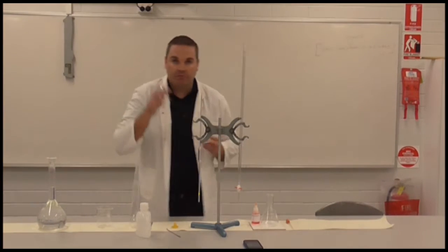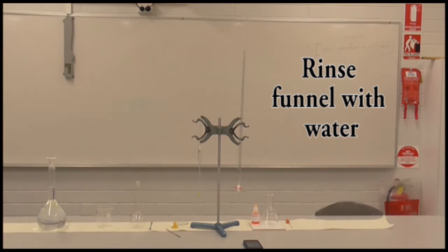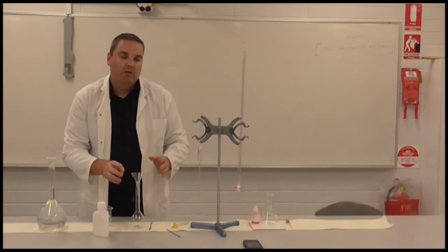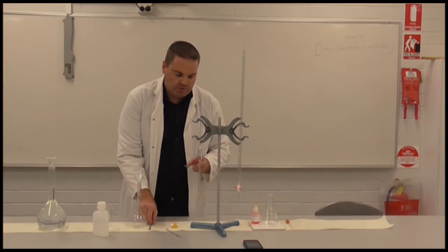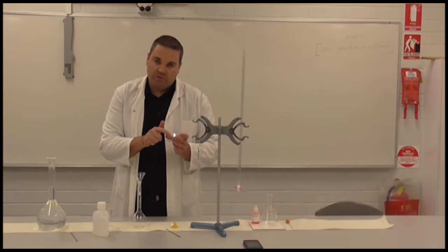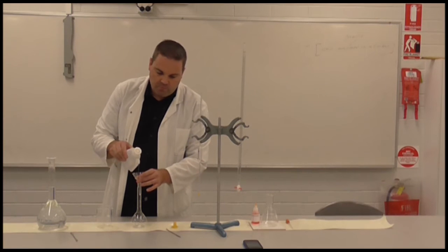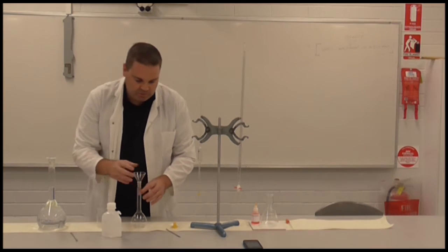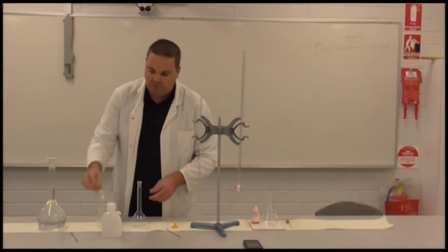I'll take my funnel and put it into the top of the flask. My funnel I should actually rinse with some distilled water beforehand as well. It doesn't need to be dry because we're just going to rinse it down anyway at the end — and your conical flask doesn't need to be dry either. We've got our sample on our watch glass, so we're going to transfer that in. There's a little bit left on the surface of the watch glass, so we actually rinse that in as well. We want absolutely no residue left on the end of our funnel and nothing left inside, so that everything is transferred inside the flask.